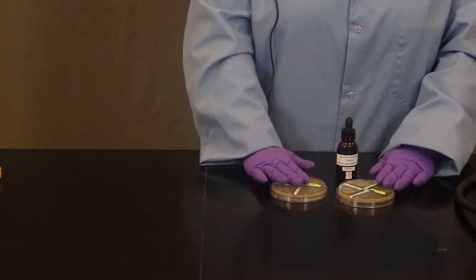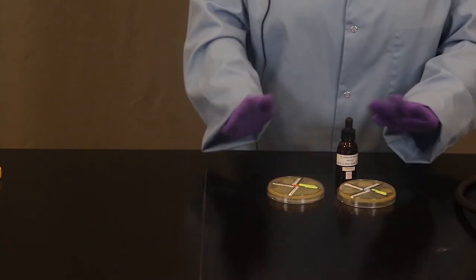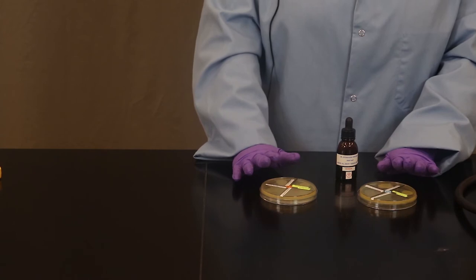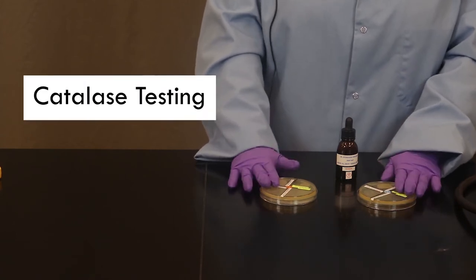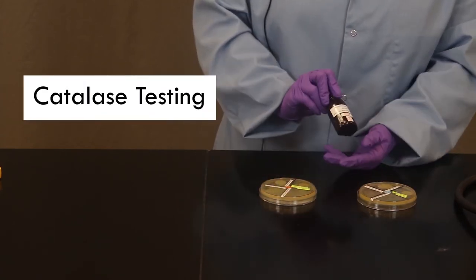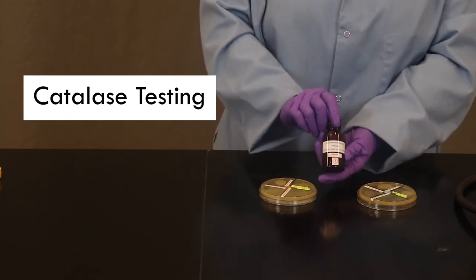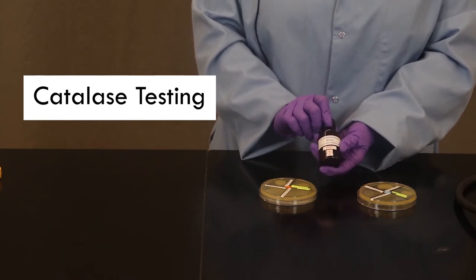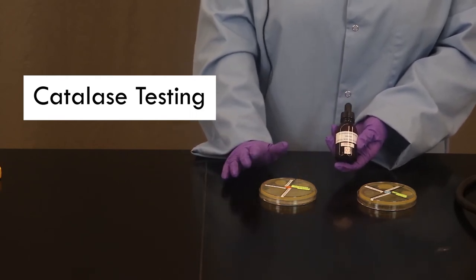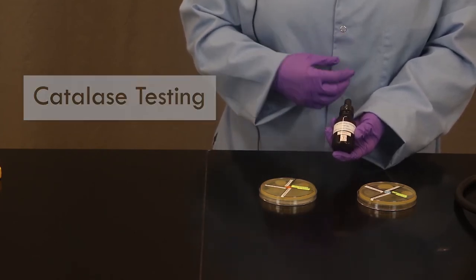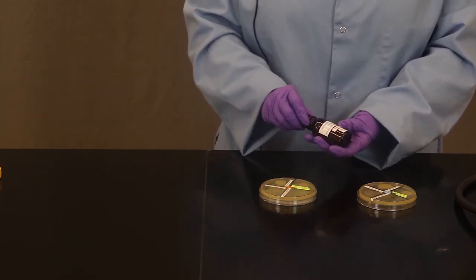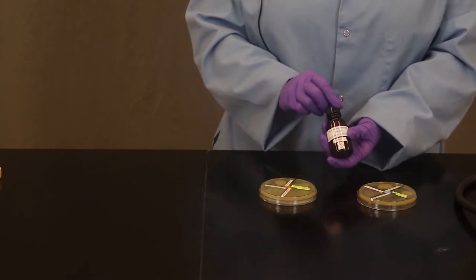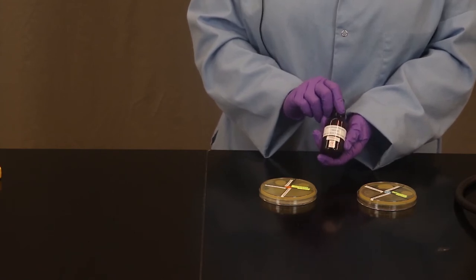So you're going to record your observations of which organisms grew where. But in addition to this another way we can test oxygen requirements is through what we call catalase testing. The catalase test requires the addition of hydrogen peroxide. If a bacterial organism produces the catalase enzyme, it's going to have a chemical reaction that creates oxygen. And we're going to see that form as bubbles. This is one of the multiple protective enzymes that aerobic organisms or the variety of aerobic organisms can use to survive in the presence of oxygen.